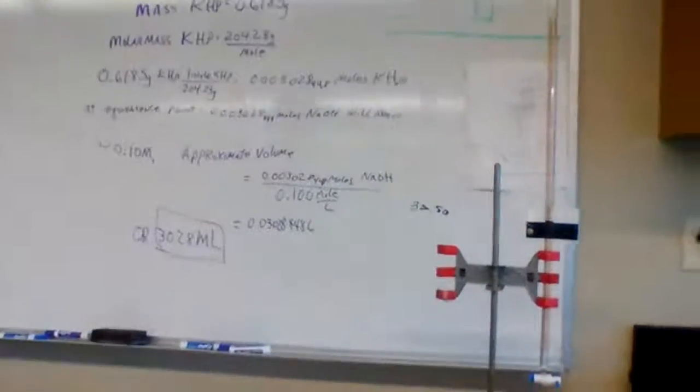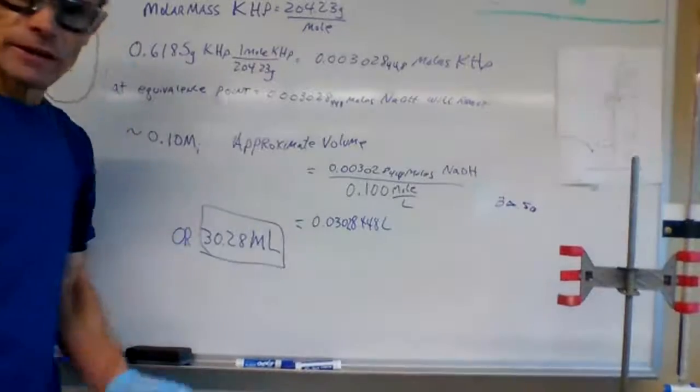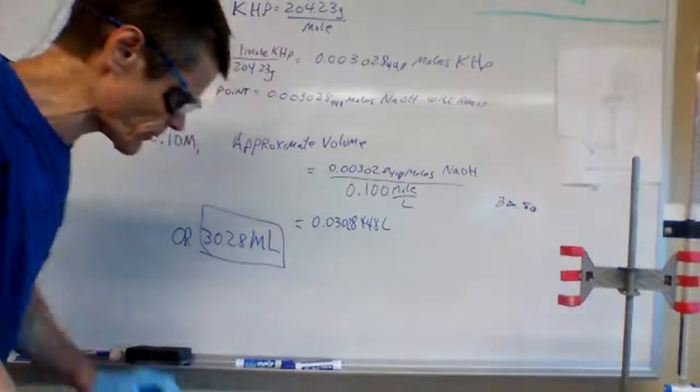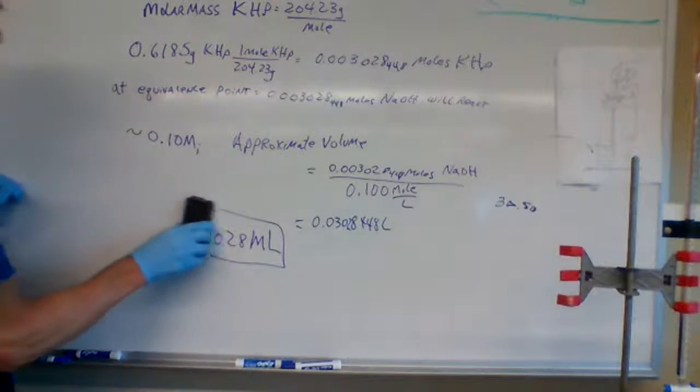Let's return to our data. Remember, our goal in this experiment is to determine the precise concentration of our sodium hydroxide.